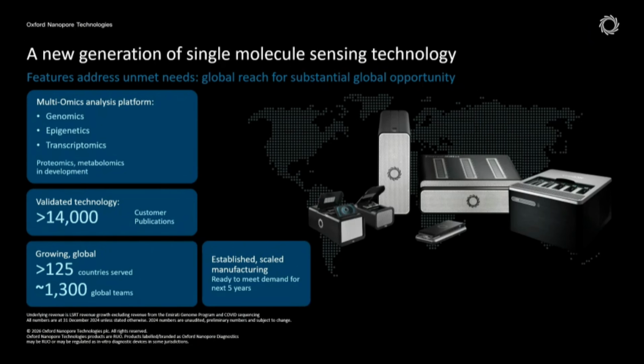They have developed multiple sequencing devices, from very small scales, all the way from the palm-size sequencer to very high-scale, printer-sized machines, as shown in the pictures. We will go through some of the devices available from Oxford Nanopore.